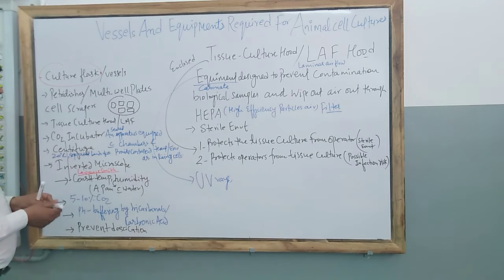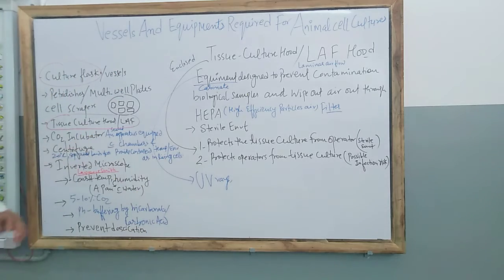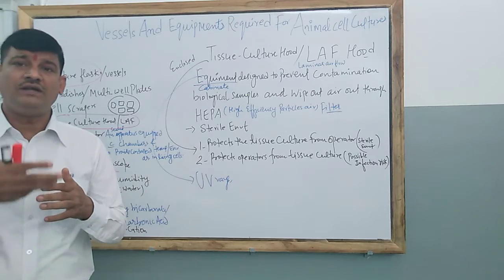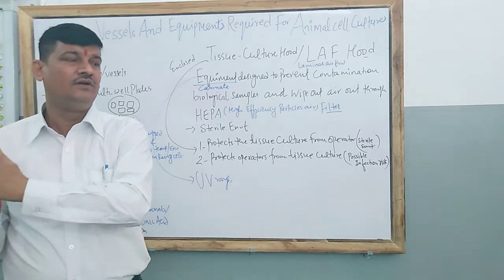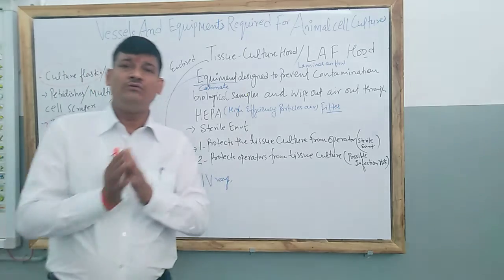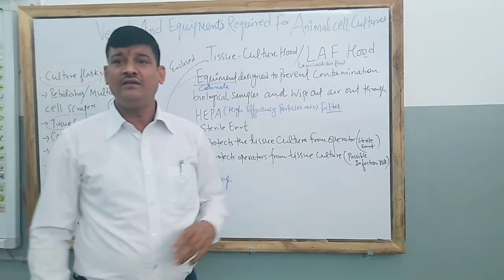Now the basic important equipment is the tissue culture hood. What is the tissue culture hood? It is also known as the laminar airflow hood. What is the meaning of laminar? It is a continuous movement of air or fluid in multiple layers, not direct air moving and reaching the points. When the air or fluid moves through layers, suppose this is one layer, then a second layer, then a third layer, then a fourth layer, this type of movement is called laminar airflow.